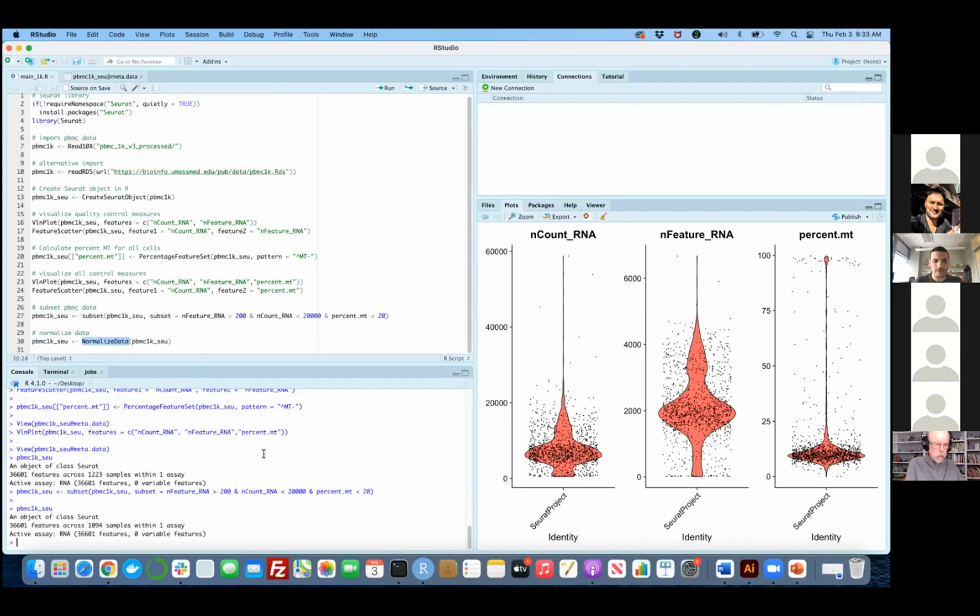First, I'd like you to take a look at the part where we are storing the raw RNA counts in the Seurat object. If you go to your object, you click on @ and choose assays. After you choose assays, you click on $, which lets you choose which assay you want to work on. Seurat is a highly functional package. It allows you to analyze multiple assays at the same time. In this case, we only have RNA, so we only have the RNA option.